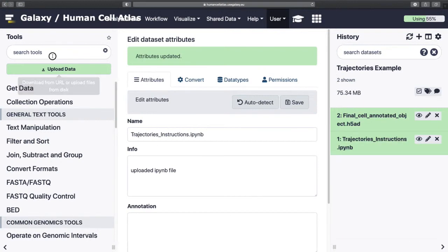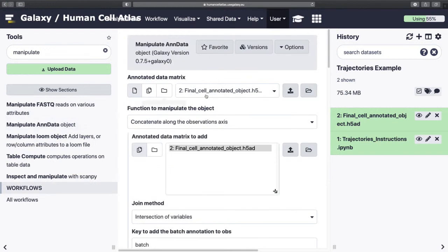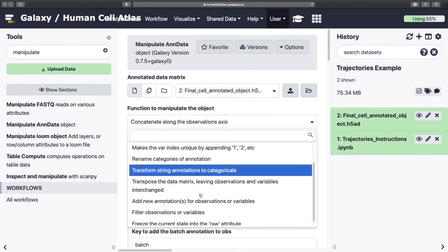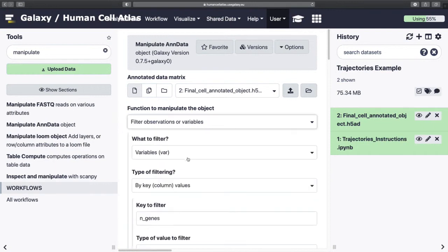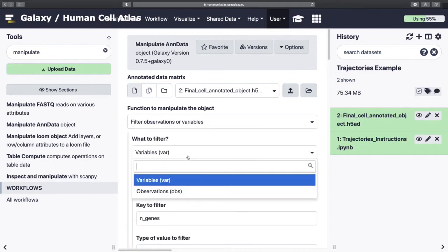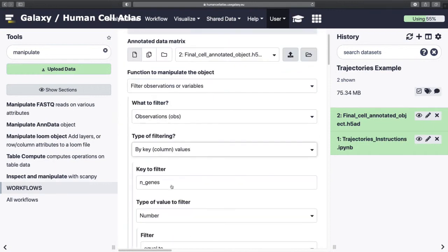And then we have the issue of the dataset currently. We want to create these lovely trajectories and see how the cells are related to each other. However, it currently has cells that are not related to anything, so they're red blood cells. We need to remove them. So we come down here, filter, orbs, poem.